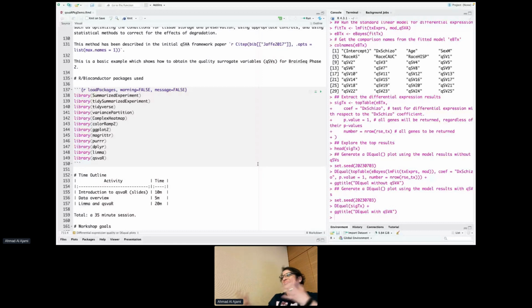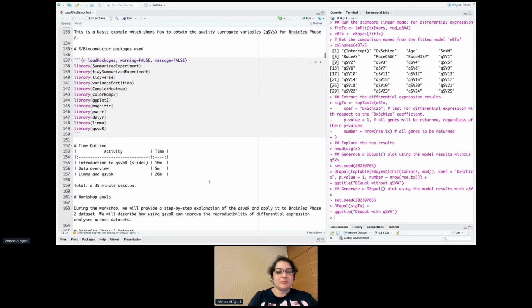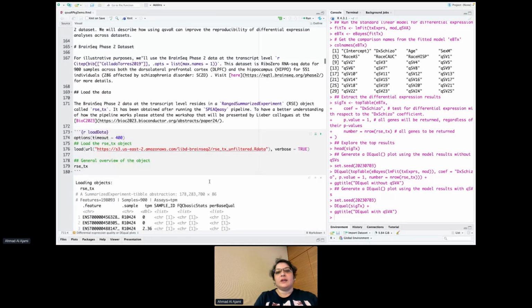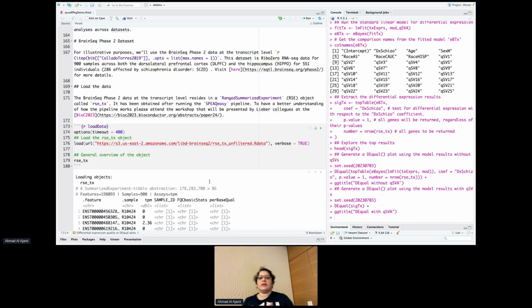So I had this backup plan. So let's load the different packages and then let's load the data. If you want to understand more about the data, there's a link to it. So please don't hesitate to go to this link to understand these data sets better.